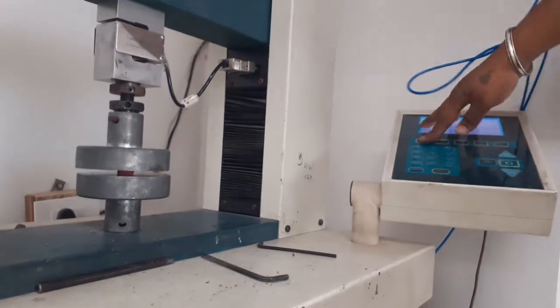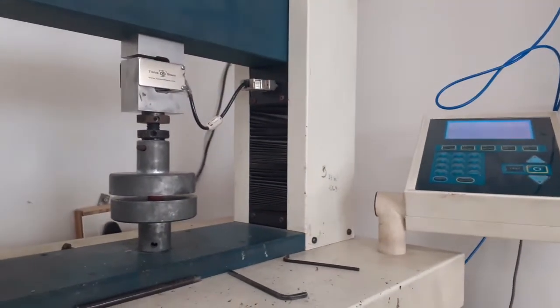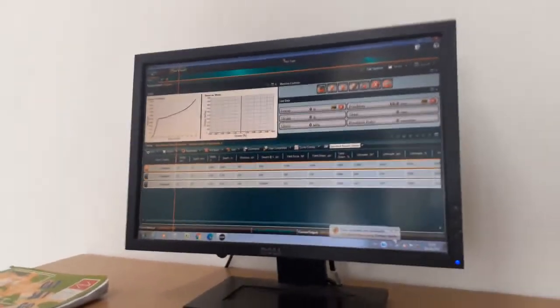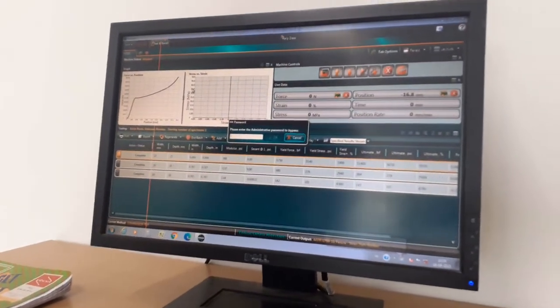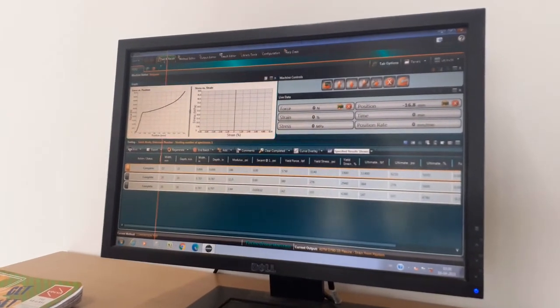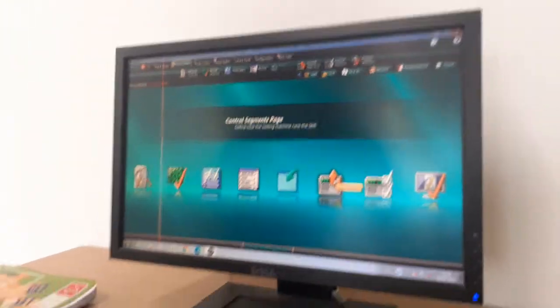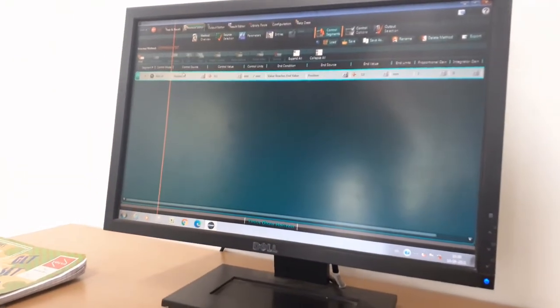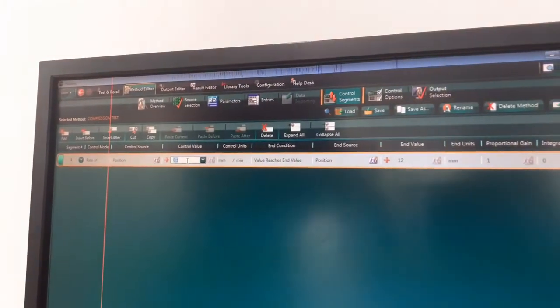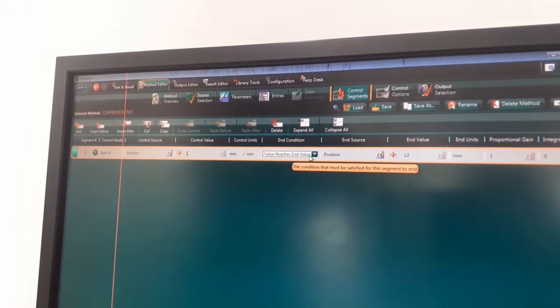Now the sample is sandwiched between those flat clamps and we have to set the position rate. First we go in method writer, then this control segment page. Here is the position, this is the control value. For this sample we use 1 mm per minute and set the end value.